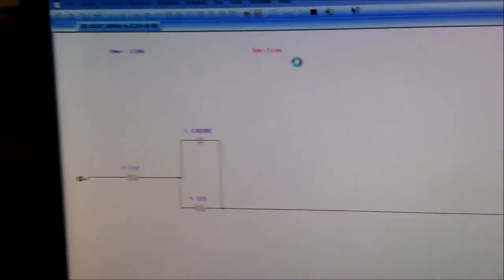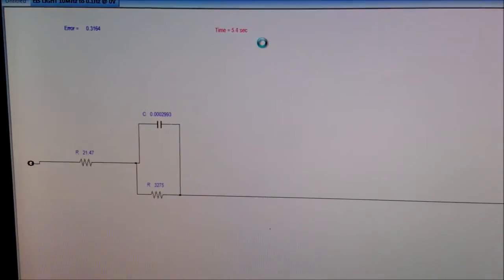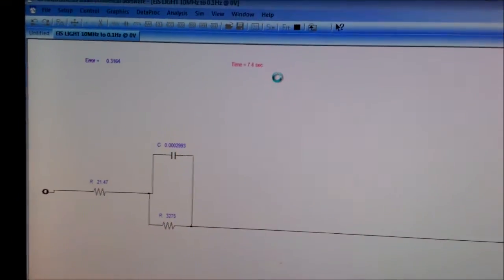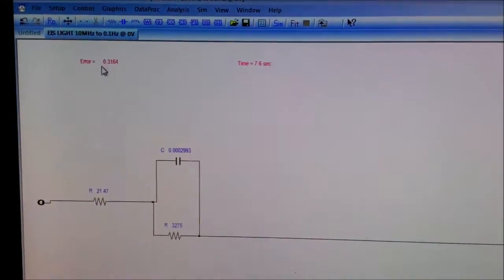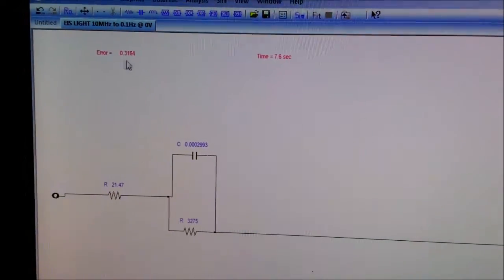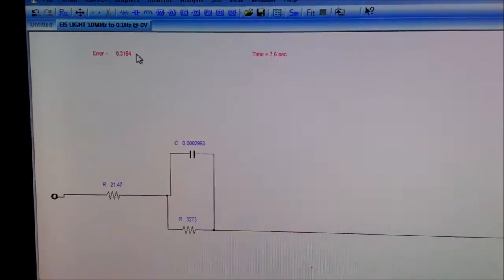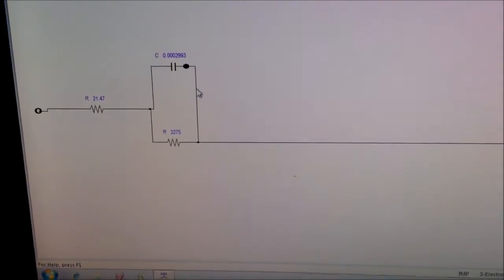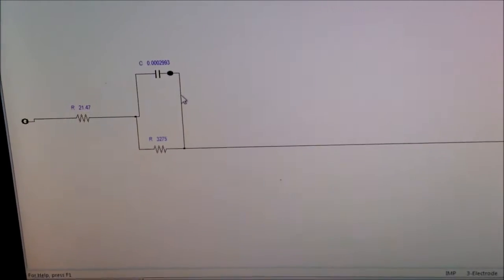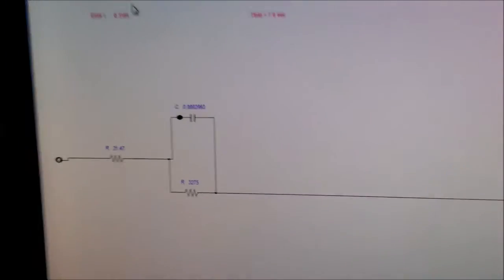The software has started working but you can see that this is a high error — almost 31.6% error. So it's not going to work. We have to change this circuit and reduce this error.